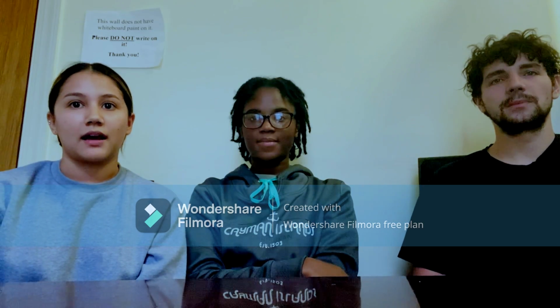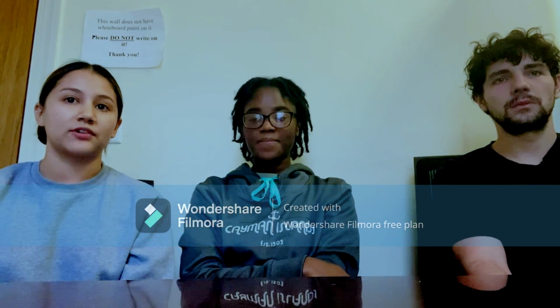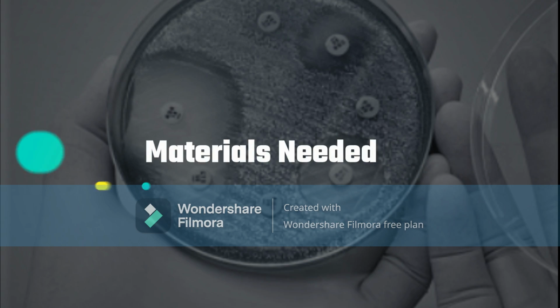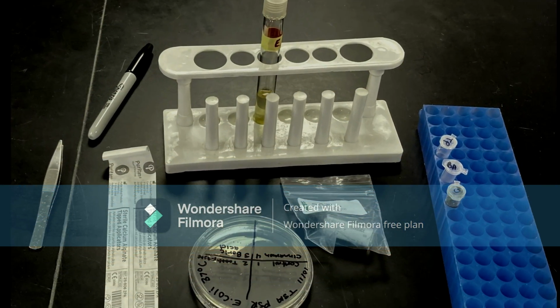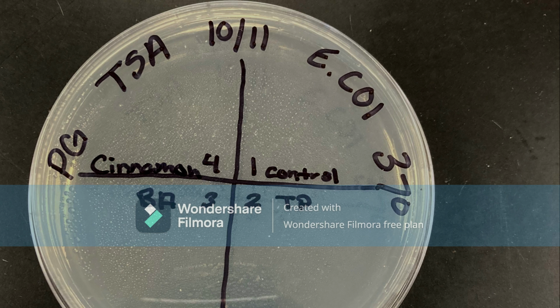Then we will be looking at previous plates that we have already prepared to see how different organisms have reacted to these three substances. You will need the following materials seen here to conduct the Kirby-Bauer assay. We will label the outside rim of the Petri dish on the agar side. Always label with the organism name, the treatment, the date, the type of agar medium being used, and the optimal incubation temperature of the organism you want to grow.